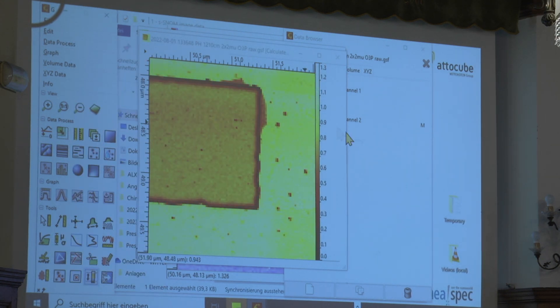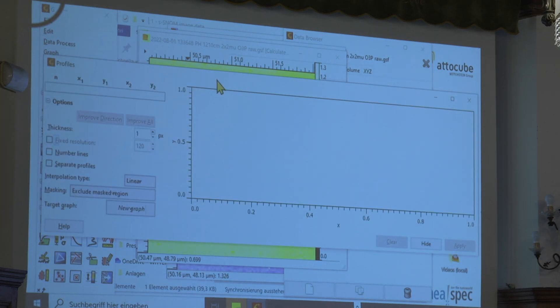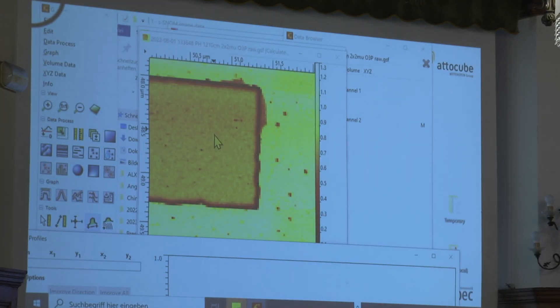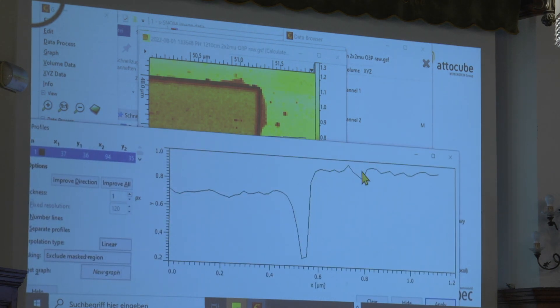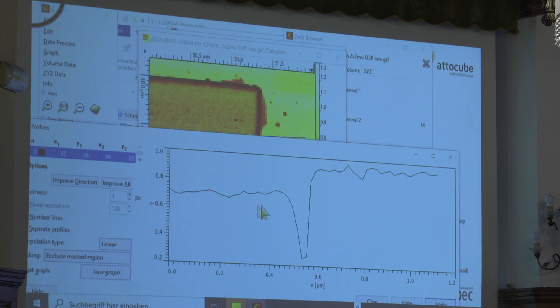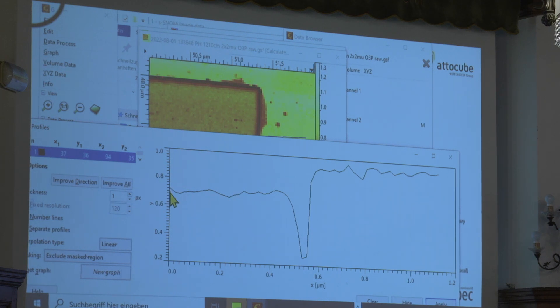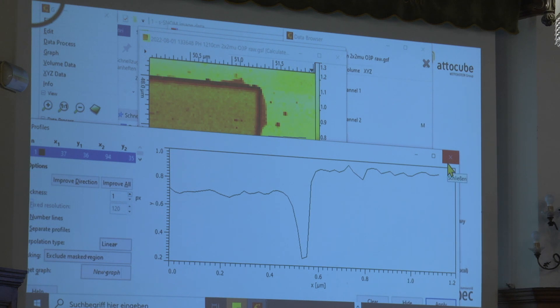Now what we can see is the values here are around one on the substrate. We can even make a line profile to see it's roughly one on the silicon — there's also dirt on the surface which is included. So now we can say on the silicon dioxide the amplitude is 0.7 times that of silicon. This now has a physical meaning — that's why we normalize. And in Gwydion, it was easy.